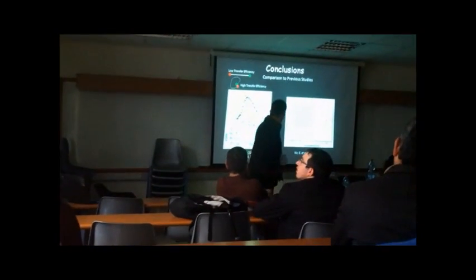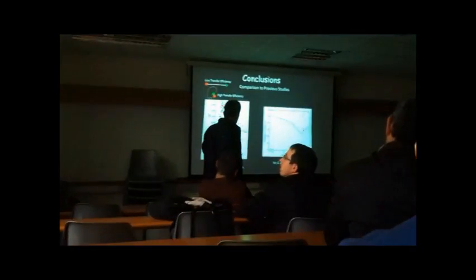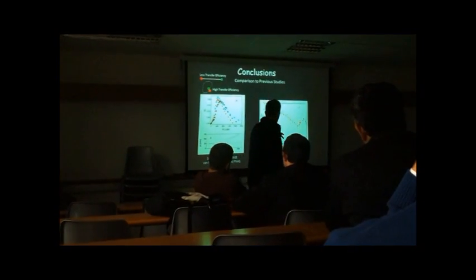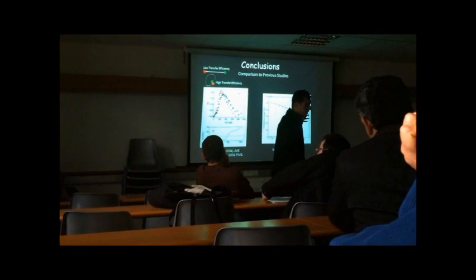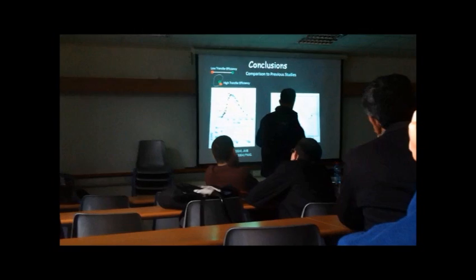And you can see that in the Vanut experiment the persistence actually increased up to almost 150 nanometers, which is about 3 times higher than with no HU. And in our experiment, you can see again the bimodality, but it just increased up to about 35 nanometers. So we actually tried to answer these differences.